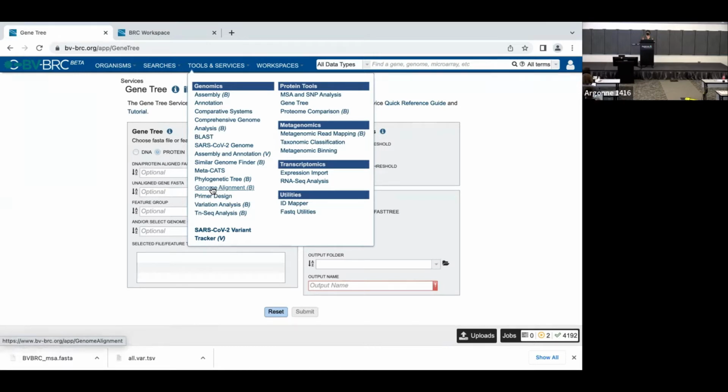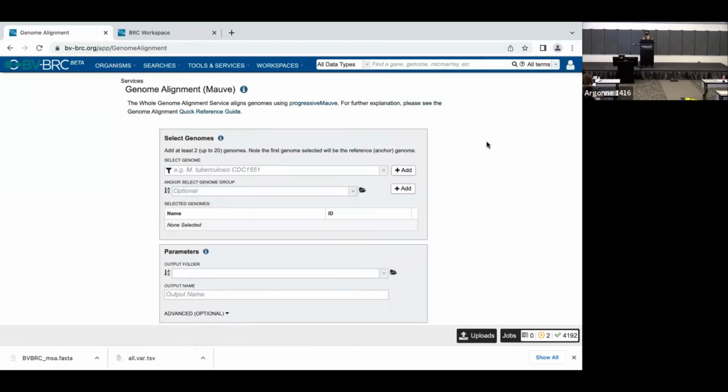Notice that a B follows it, meaning that it's only for use with bacteria now. But okay, here's some questions. Mala, could they submit a viral genome right now in Mauve? I would think maybe the pox viruses that are big enough, those might be interesting, but who knows? He says, au contraire, he has used it to visualize viruses and it has been the greatest experience in his entire life. I'm paraphrasing, but I know that's secretly what he meant.